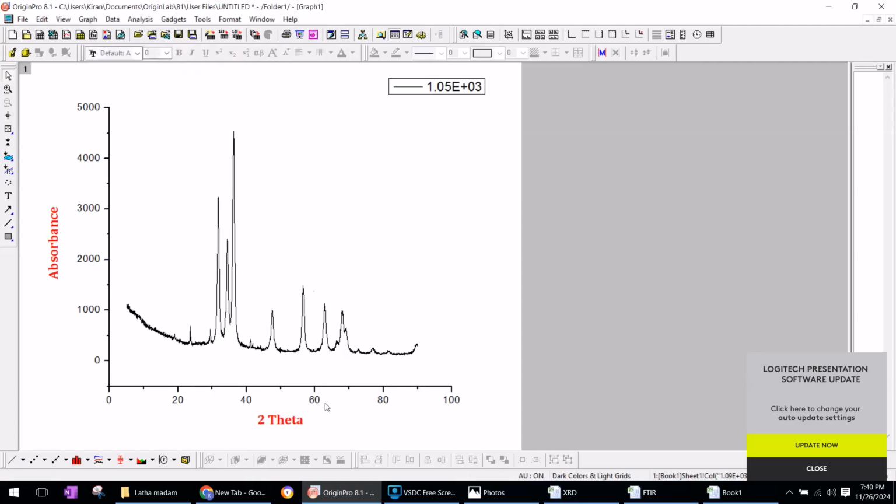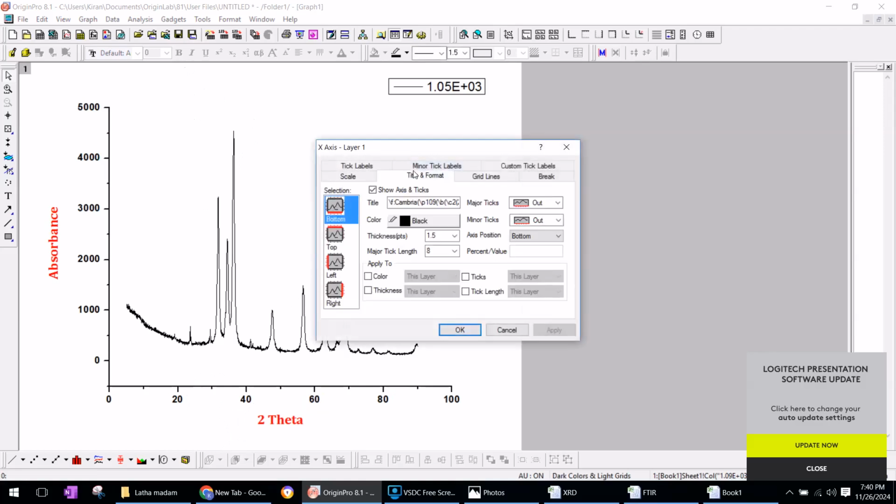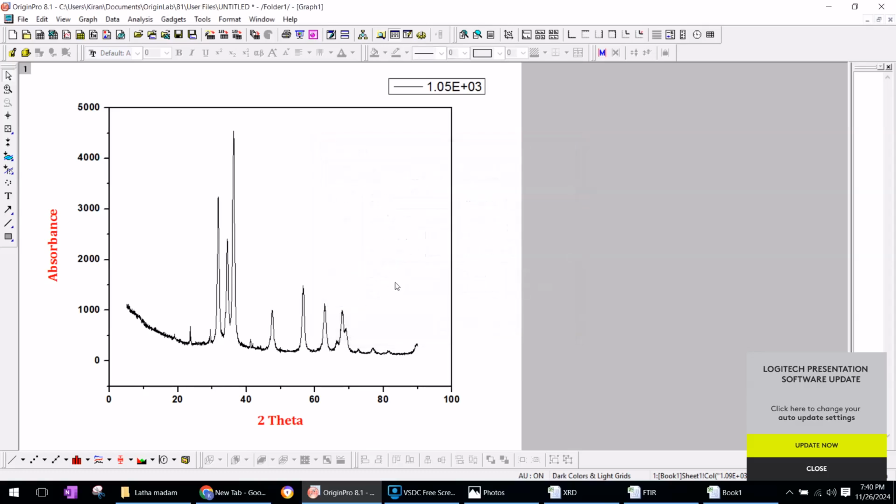And if you want, you can also change these values, and apart from this you can create the top. Here also you can add margins, so none. I will give none and apply. See, you got a line for the upper border also. In the same way I will give it for the right side also. Okay, apply like this.